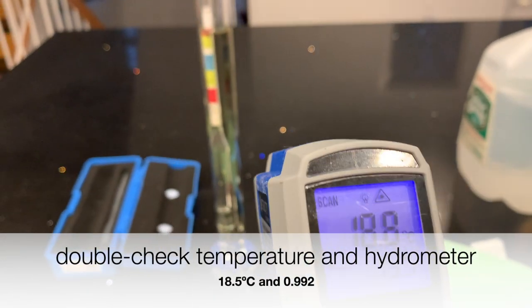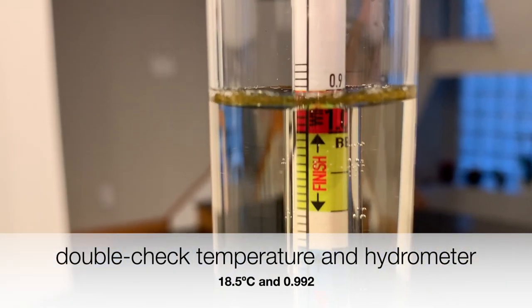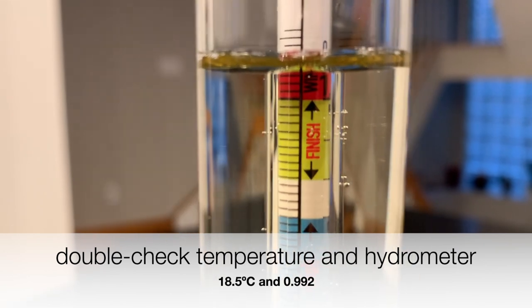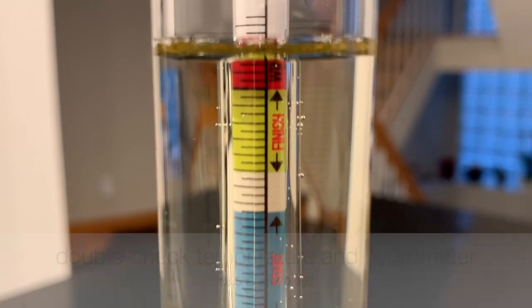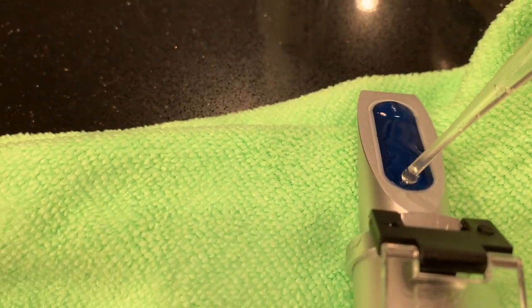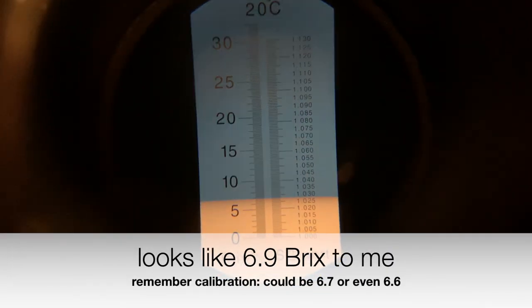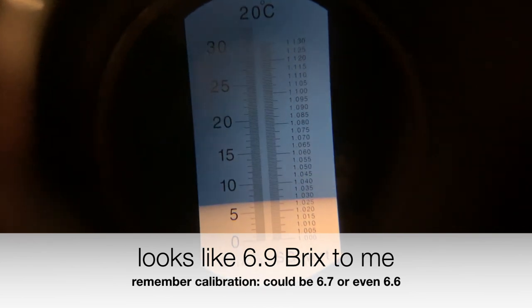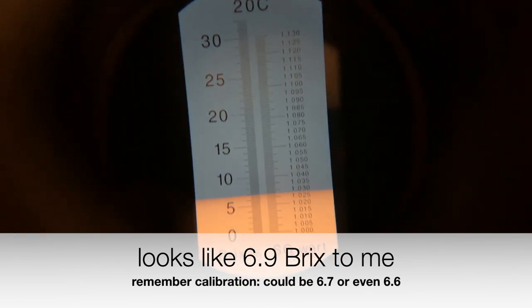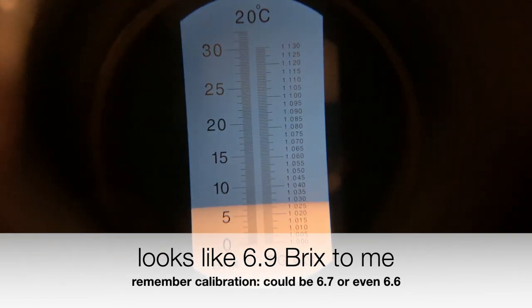Now let's double-check the temperature and the hydrometer reading. We're at a temperature of 18.5 degrees Celsius and still at a density of 0.992. Now let's get a refractometer measurement. The sample reads 6.9 Brix, but remember the calibration was reading high, so this could really be 6.7 or maybe even 6.6.